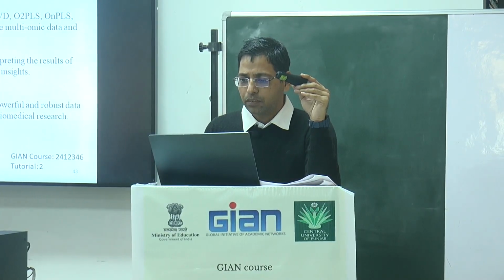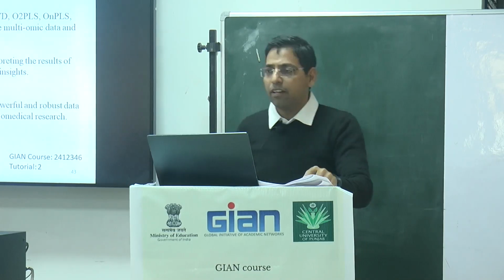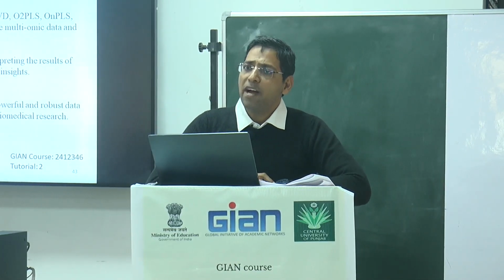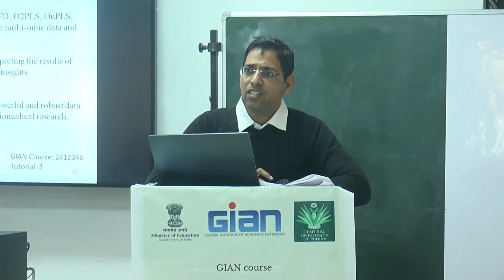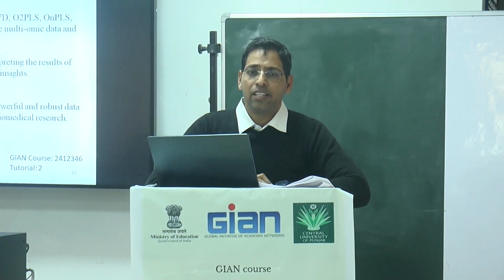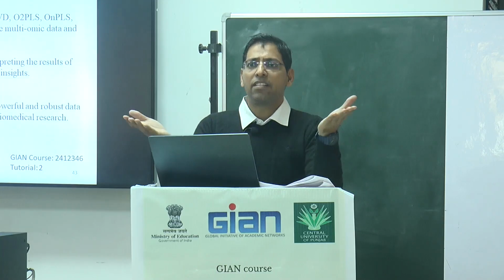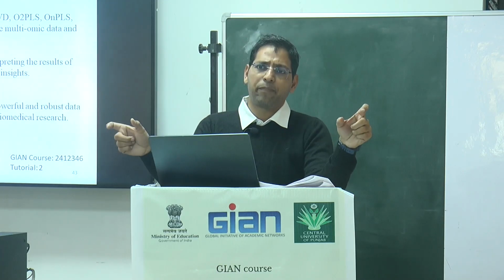So if it happens in one run time? Basically, if you optimize all these conditions, there is less chance that you will get the same retention time if your machine is working in Los Angeles and your machine is working in Beijing. The concept is the same. If the conditions are the same, RT is also the same.